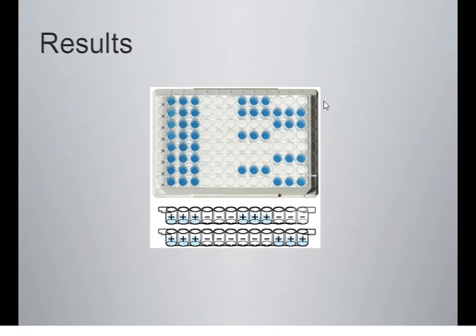Then you have your samples, and we do them in triplicate just to make sure that they're being done right. And these samples are basically what you get from when you are sharing the fluids with each other. That's what we were going to simulate with the outbreak: one person was going to have it, nobody else was going to have it. That one person would have spread it to another person, and then they would have spread it to another person, and then they would have spread it to another person. And by the time we got done, over half the class was essentially going to be infected. And we were going to try to trace the outbreak back to the original source.